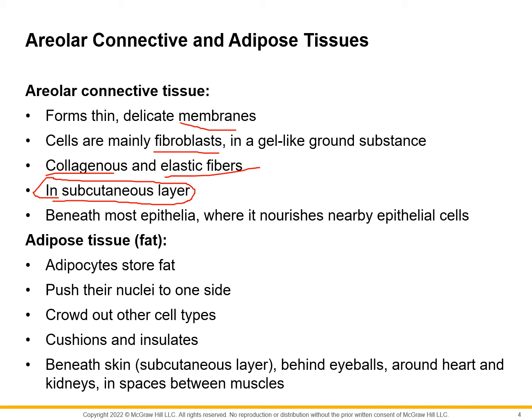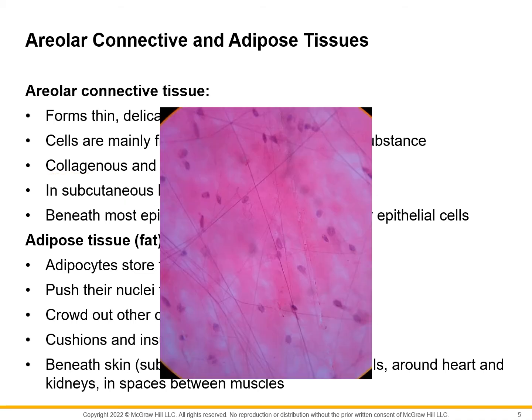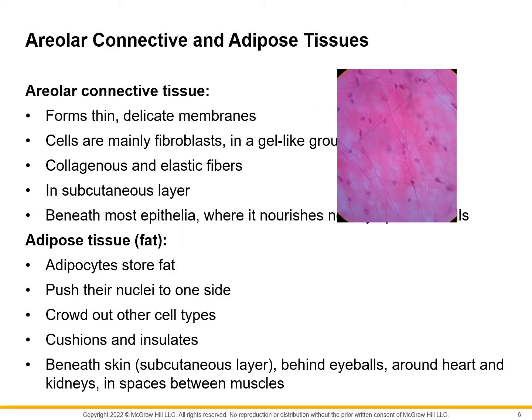And so when you get into dissection, you'll see this very fragile tissue, and as we separate certain things, it almost looks like, for lack of a better way to describe it, cotton candy, because it'll just kind of disappear, and that is areolar tissue. But this is our tissue slide from lab. Again, the defining feature is these little hair strands all throughout it, and no other tissue slide that we have looks like that.